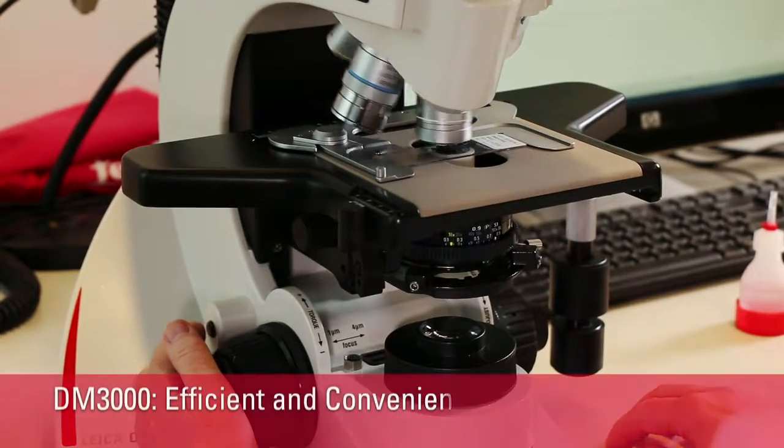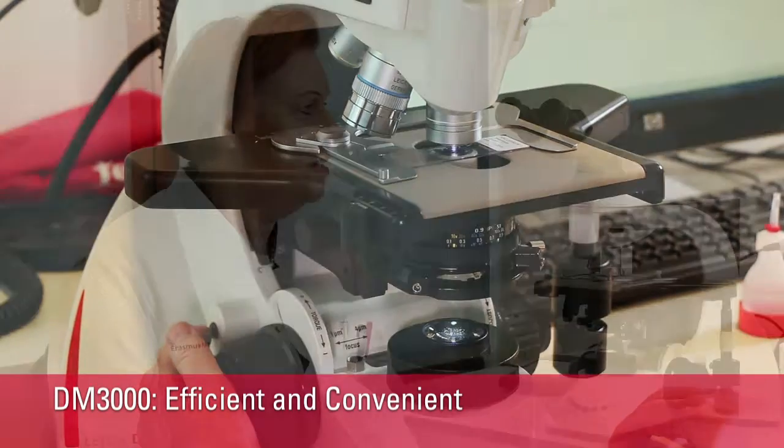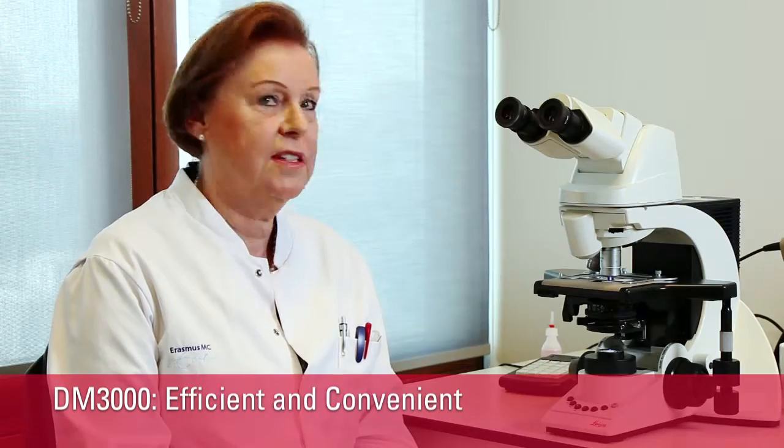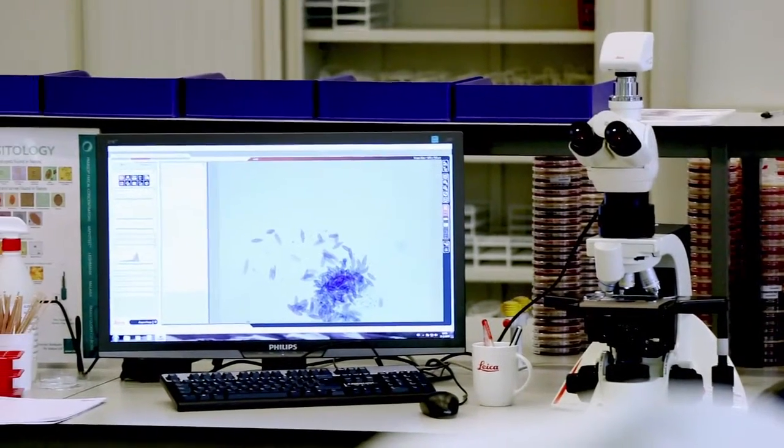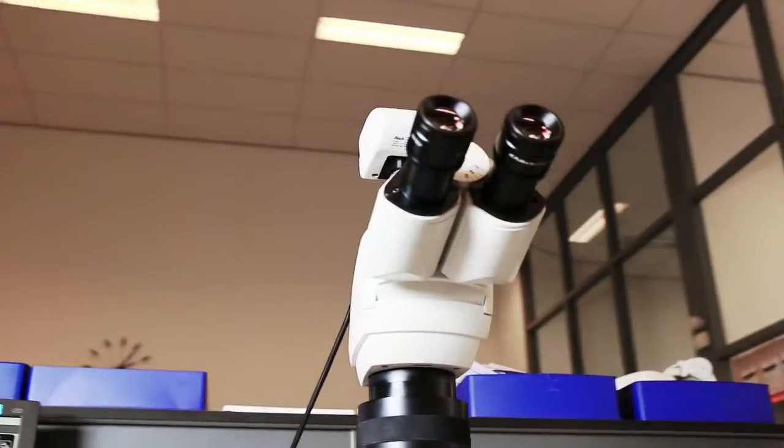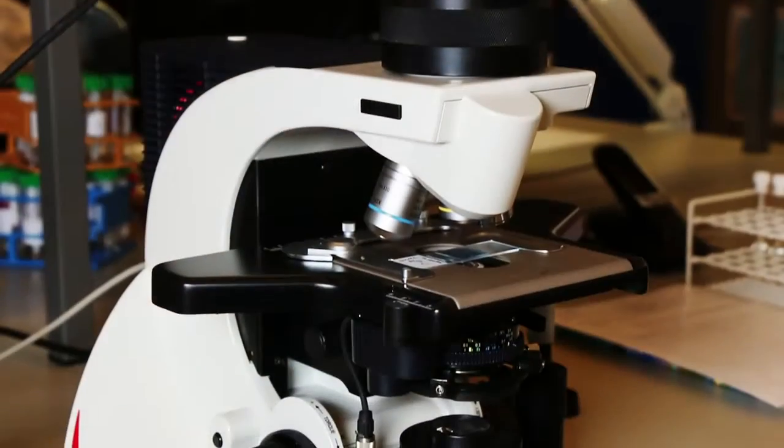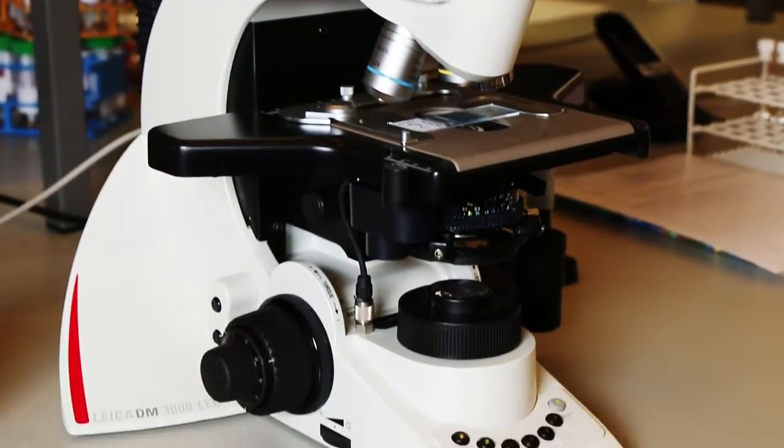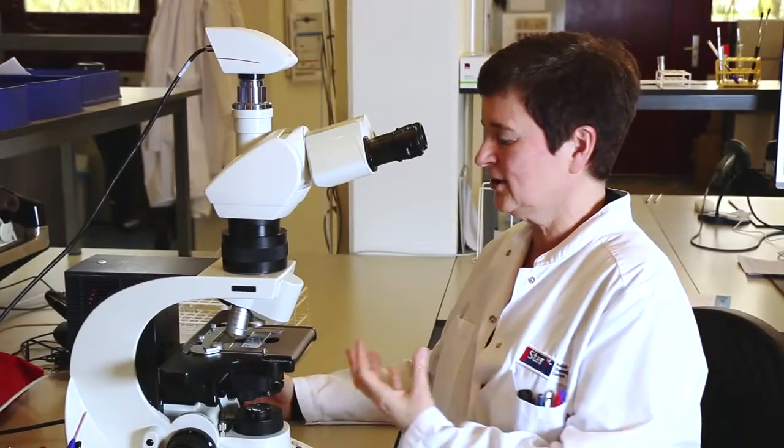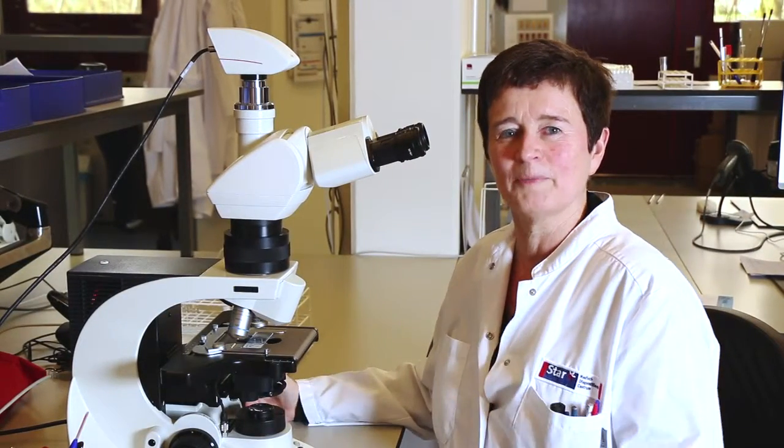It's a very nice microscope to use because it's very convenient and very easy to use. I like this microscope very much because it's easy, the pictures are very clear, the light is good, it's sharp, it's wonderful.